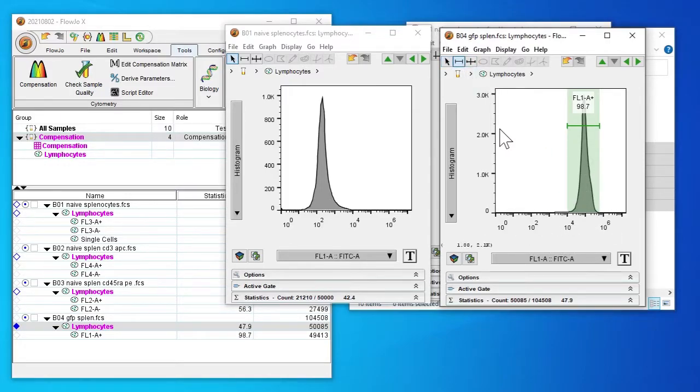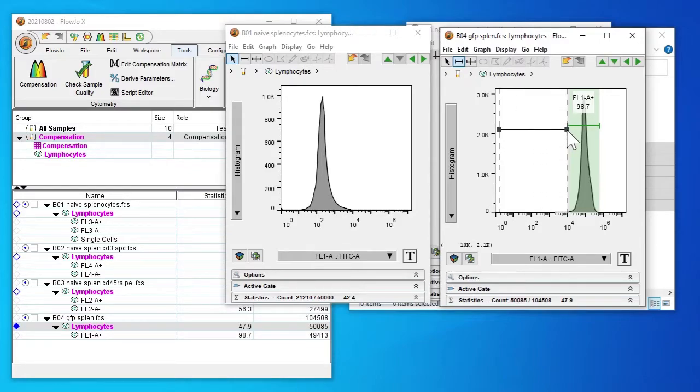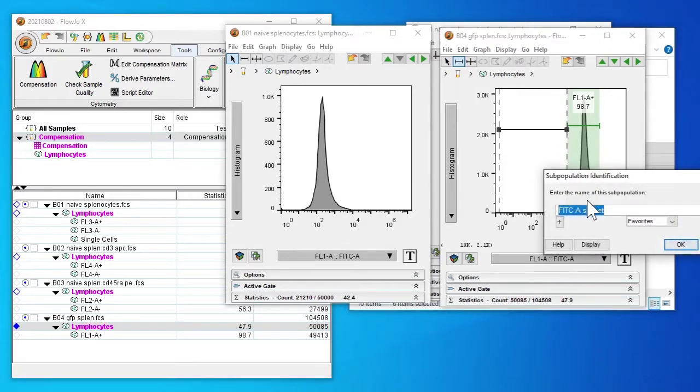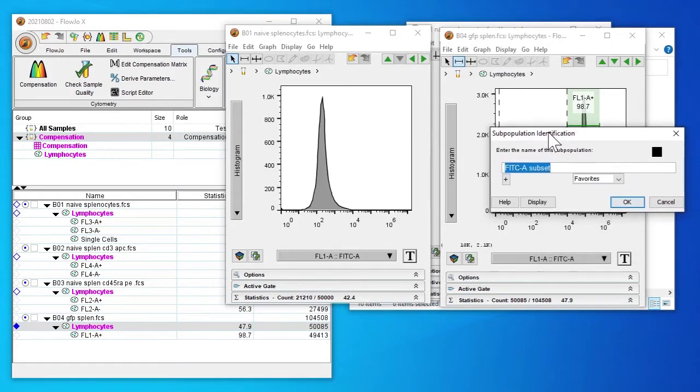So again, use our negative non-stain control. We can see that max is around 10 to the power of 4. And we'll also set this to 10 to the power of 4 and rename this as FL1A minus.